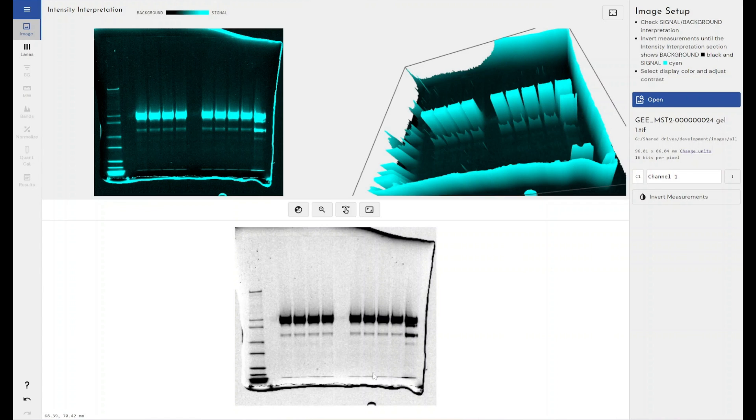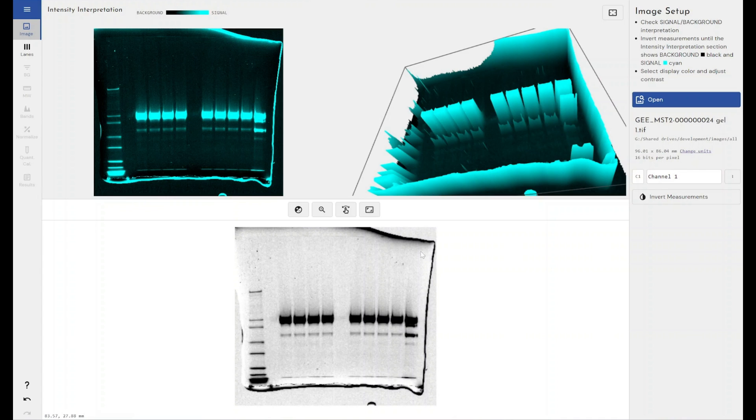But what we're going to do is we're going to tell the software where our band is, we're going to tell the software the entire length of the lane, and it will automatically perform that calculation for us.